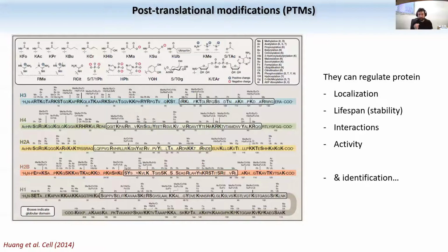It can become really complicated very quickly because some proteins, like for example histone proteins, have hundreds of possible modifications. That's actually what we do in our lab. We study histone modifications, and this is just a cartoon showing you the type of modification that can be identified on histones, and here is how decorated histone sequences can be. Actually, this table is old. There are many more now.